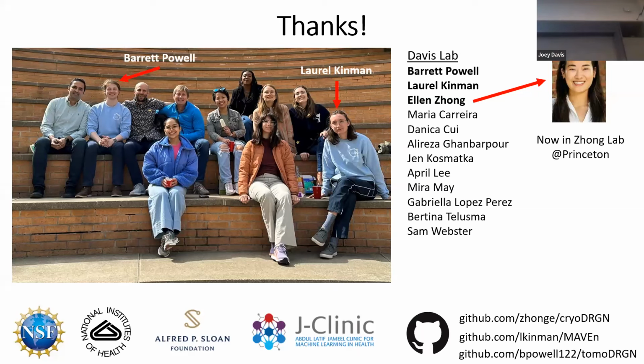You showed nice images of the latent space from training an autoencoder, and then you showed a video of a drag across the latent space. It seems like you could drag almost any direction, and I was just wondering what you think about that. If you're going to show a movie, you must pick a path. You're not going to pick every possible path.